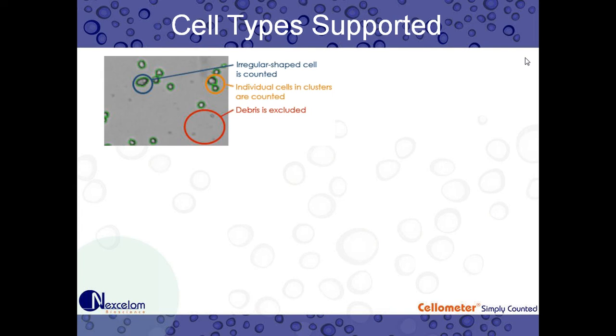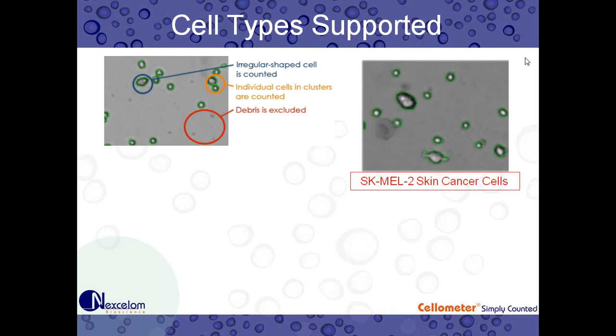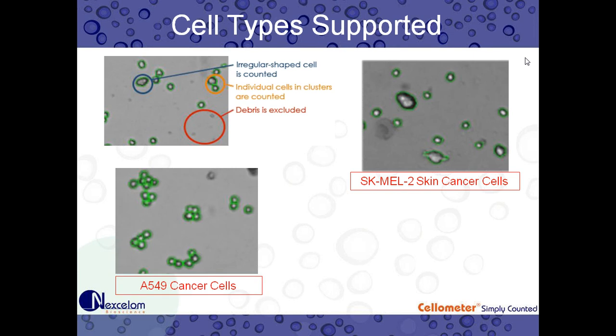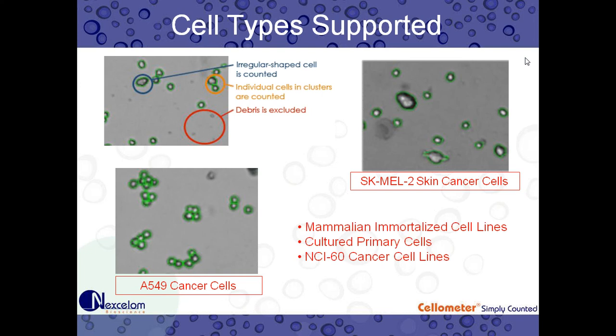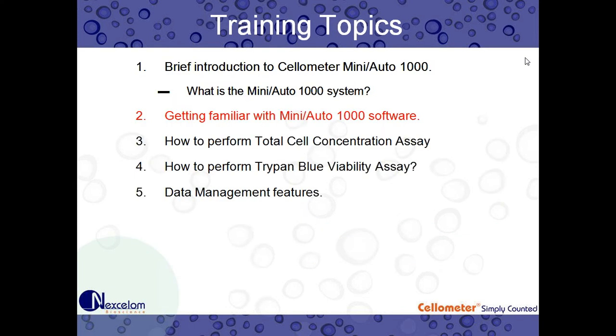So just to quickly look at some of the different cell types that we support. First is an example of a slightly heterogeneous population. This is a cell line. You see that there's some irregular shaped cells. There's some cells in clusters. And then there's some really small debris that's excluded. So that's just one example. Another example. Here we have another irregular shaped skin cancer cell line, SK-MEL-2. You can see that not all the cells are perfectly round. However, we're still able to count those. A549 cancer cell, clumpy cell line. You can see that we can cluster those cells very well. And then just to go over it again. So we can count. The Auto 1000 and Mini are for mammalian immortalized cell lines, cultured primary cells. As many of you probably are familiar with the NCI-60 cancer cell lines. There's quite a few cancer cell lines there. So clean samples, free of debris.